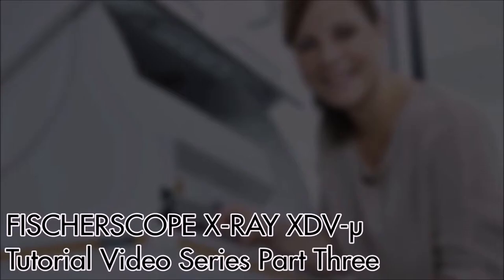Welcome to part 3 of the FisherScope X-Ray XDV-MU tutorial video series. If you have multiple samples to measure or would like to measure multiple points on a sample, the XY programming function will enable you to do so easily.